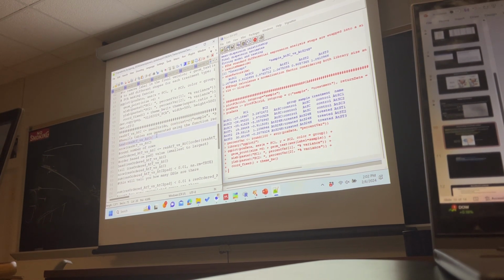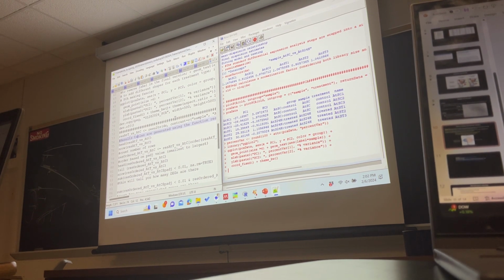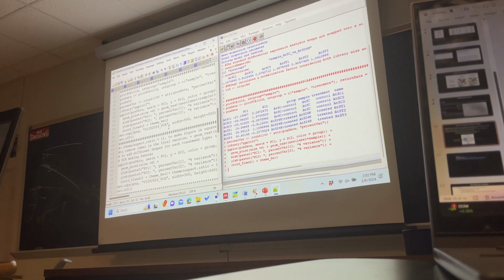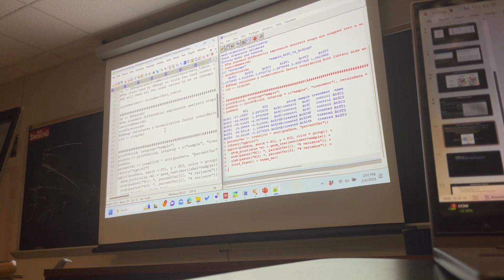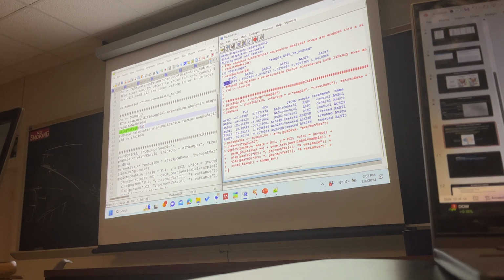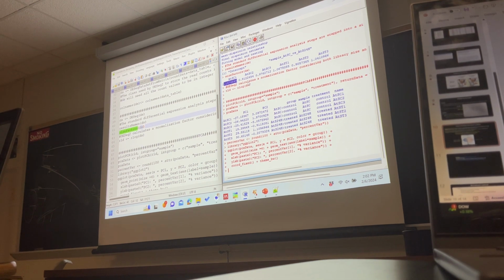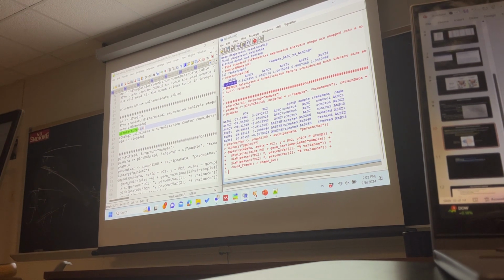So okay, we did calculate some type of normalization factor, the size factor? Okay, we calculated it already. Here, this is the thing that we were talking about the other time. So this value here: when it is normalizing for each gene, at last it will have some type of value here.